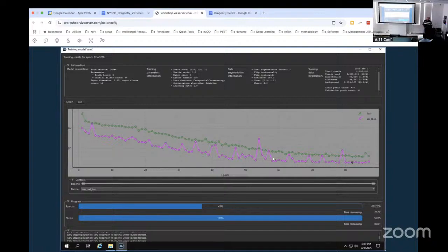Is pretty much everyone ready to be done with this training part? I didn't come here to make you stare at training sessions. I just figured since we had it, we might as well train one and take a break.